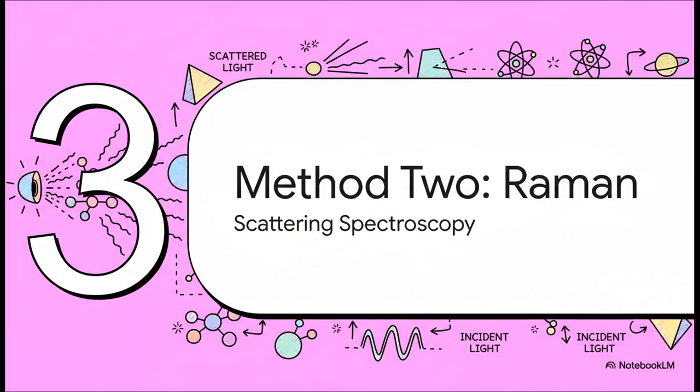All right, on to our second tool, Raman spectroscopy. Now, if IR was all about absorption, Raman is a whole different ballgame.